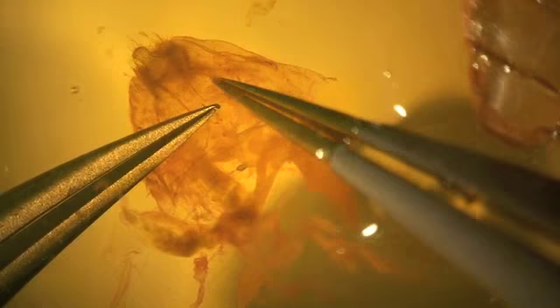The digestive tract and other extraneous material can now be easily removed, taking care not to damage the globular corpus bursa and the connecting ductus bursa.